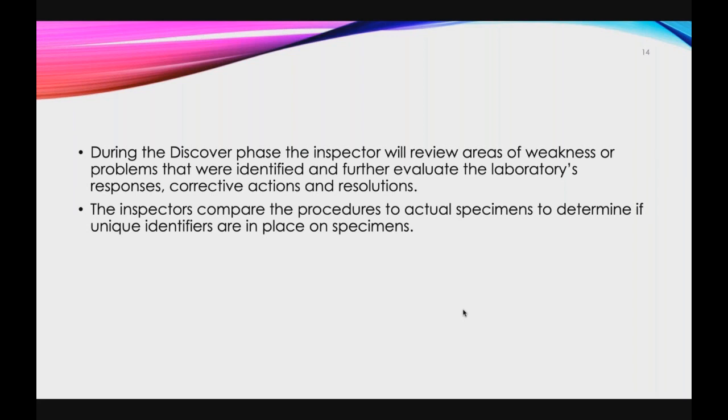So all these different things, they'll start to go in a little bit more in depth based on what they find from the read, observe, and ask. The inspectors compare the procedures to actual specimens, and they determine if unique identifiers are in place for those specimens. That's another discovery phase.